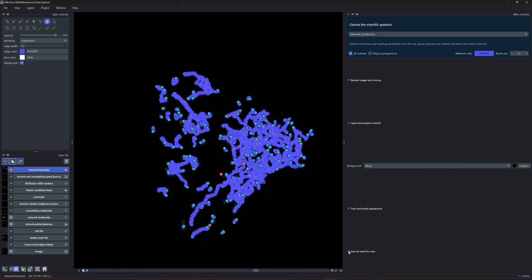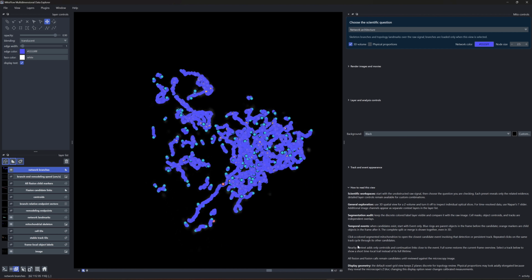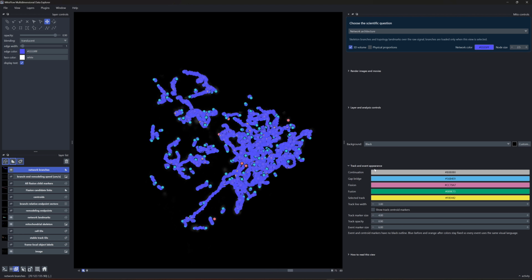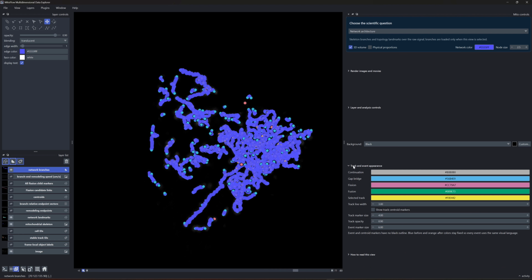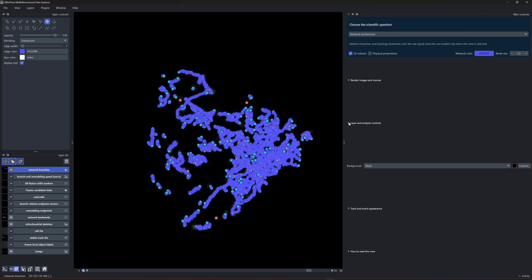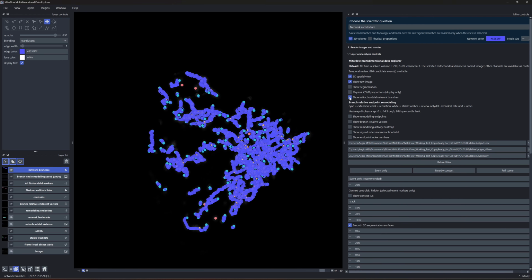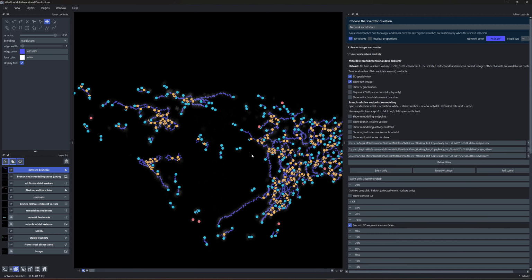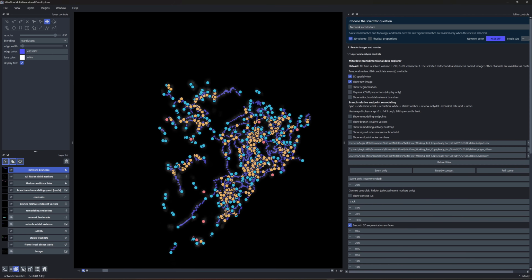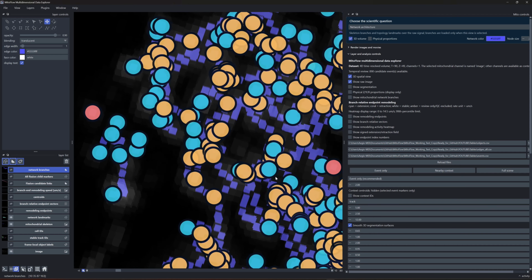And then at any point you need more information, please go over here to see how to read this. And I have some tooltips listed over there. You can change the colors from over here, where there's a collapsible options here on the right. Okay, so each one of the nodes here is representative of some sort of a fork happening in the mitochondria.